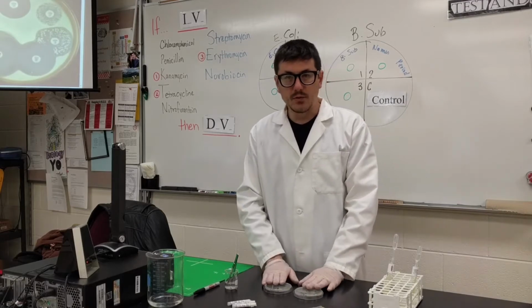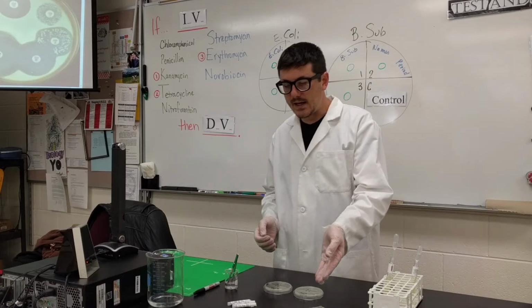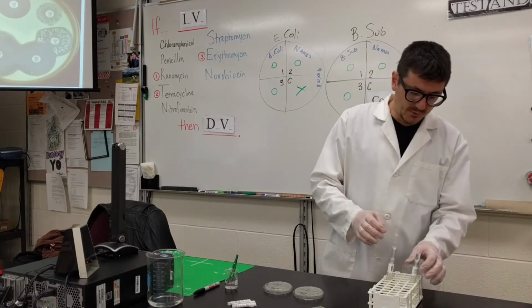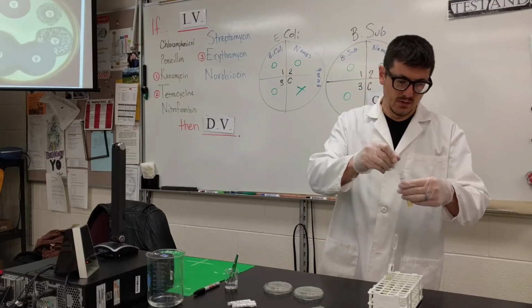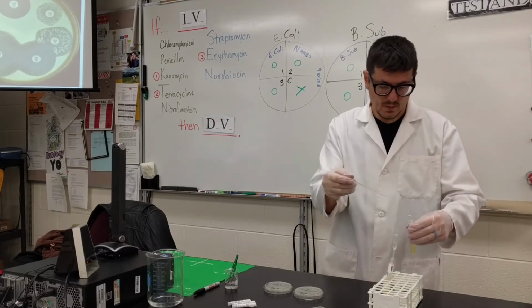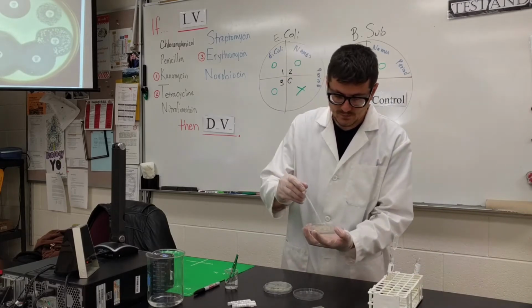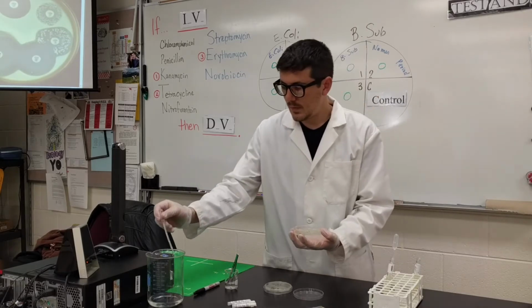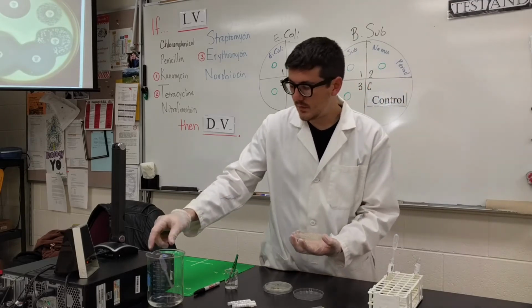So I got my petri dishes labeled. I have my bacteria ready to go and get plated. I have my inoculation loops for spreading them around, and I have my 3 antibiotics. So first things first, let's get Bacillus subtilis. Get rid of the rest. Get rid of that.